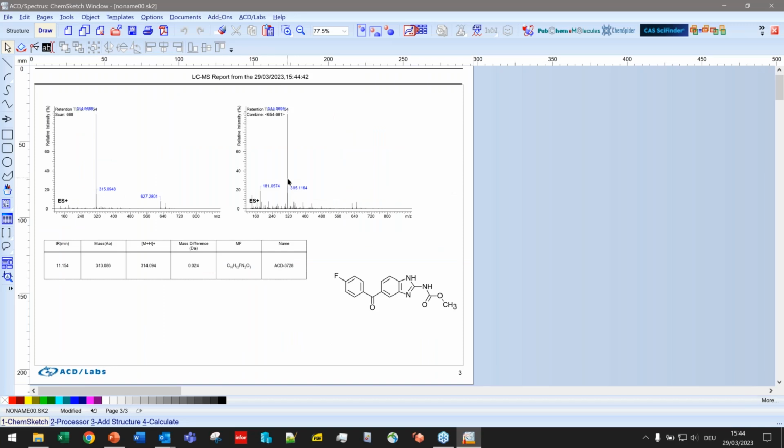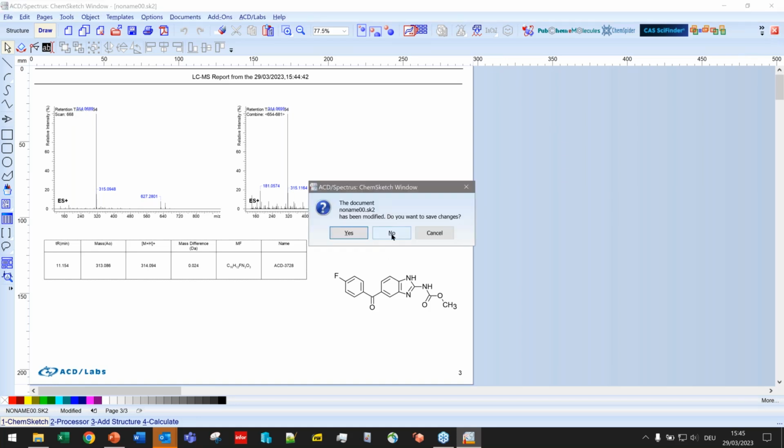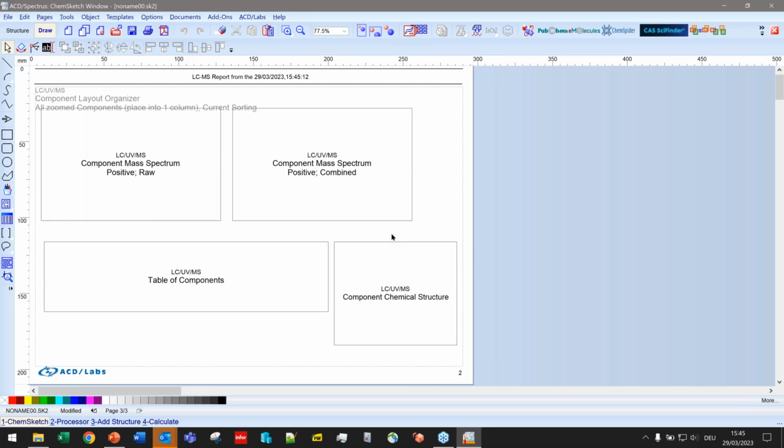So with this, I'm fairly happy. Some things that I'm not happy with right now is the height, like here you can see there's some overlap with the retention time label. I have some things that I can change. I can change the position of the retention time label, for example. I can stop having it display retention time, which could also help. So let's just do that, and then we should be done with this report template.